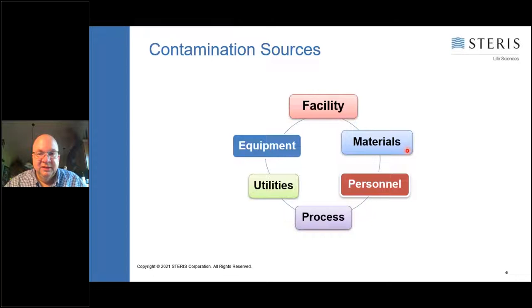Another big one is operators. They account for about 80 to 85% of the bioburden contamination in a clean room. And if you think about this, your operators shed millions of skin flakes and millions of particles a day. And it's on those surfaces that viable microorganisms can live and essentially contaminate the room or the surfaces in the room.